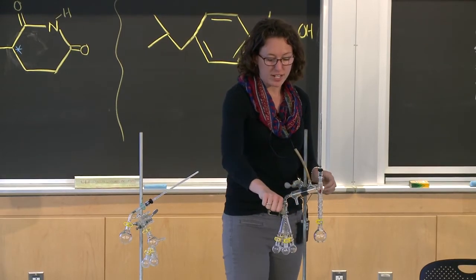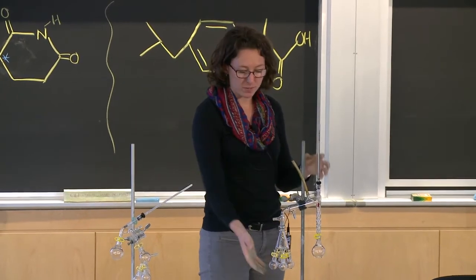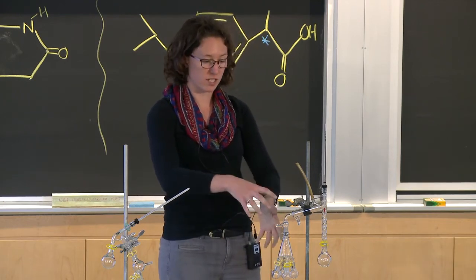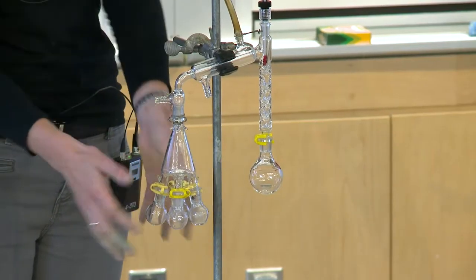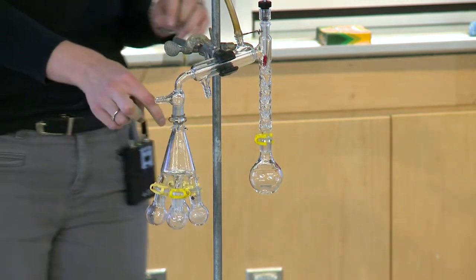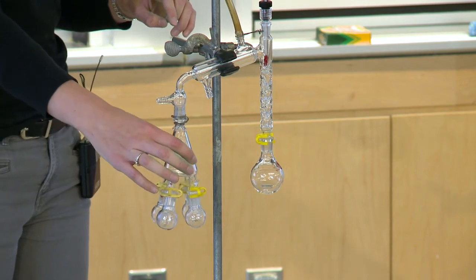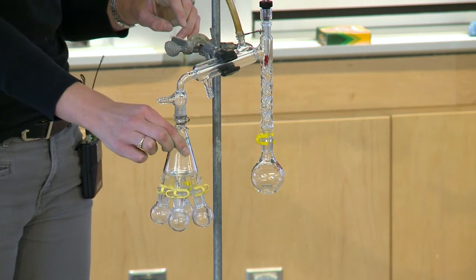So you will make sure that your vacuum line is connected here. You'll turn your vacuum on. And we're going to make sure this whole system is under vacuum, and you want to be able to collect different fractions, so your things will boil at different temperatures, right? So you can't be swapping your collection vessel in and out if your whole system is under vacuum. So we use what's called a cow adapter. This is a cow thing because it looks like some cow udders. And you can attach 4 different flasks to the bottom of it. And the ones that you'll see in lab will have a little spout here. And so you can see which flask your spout is pointing towards when you are using it. So you can rotate this so that you collect your different fractions in different vials or in different flasks.